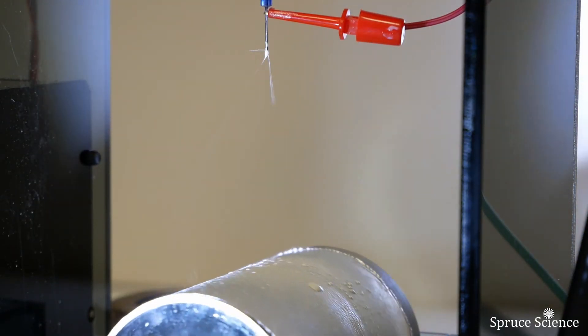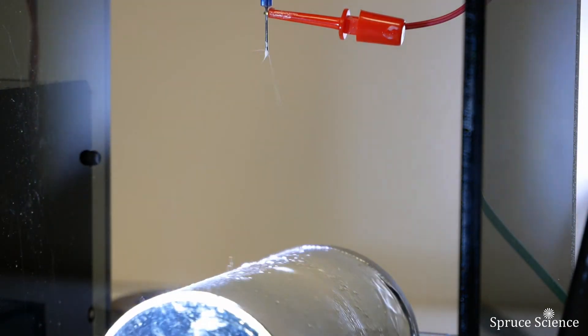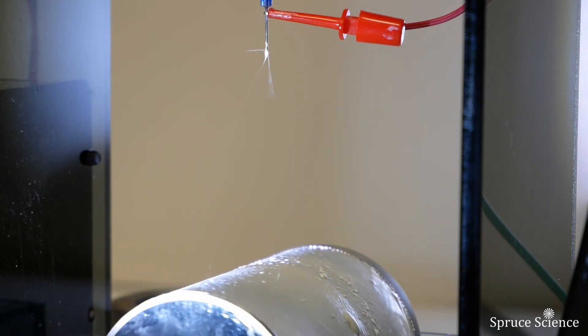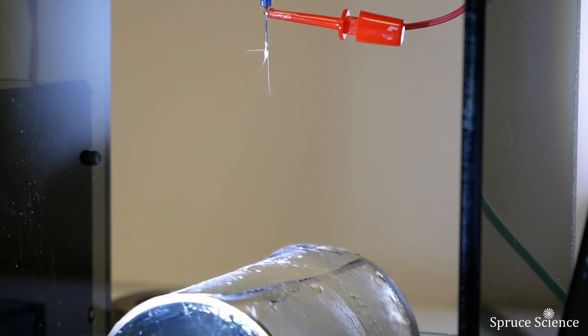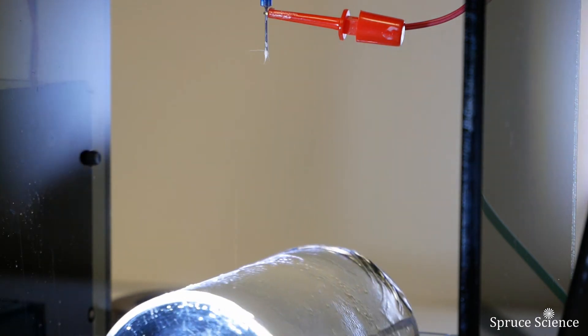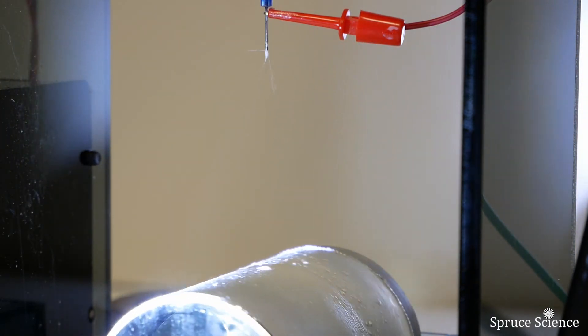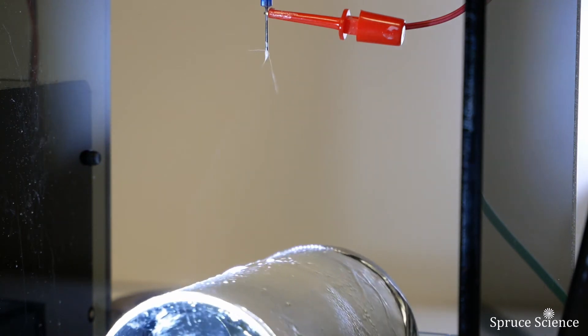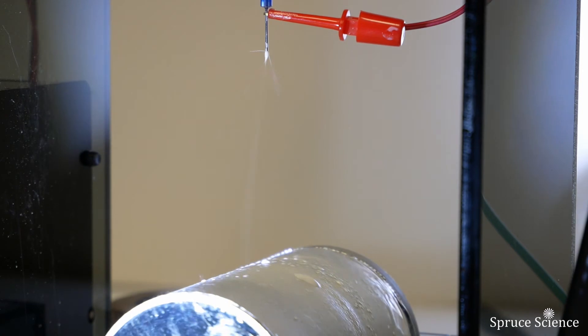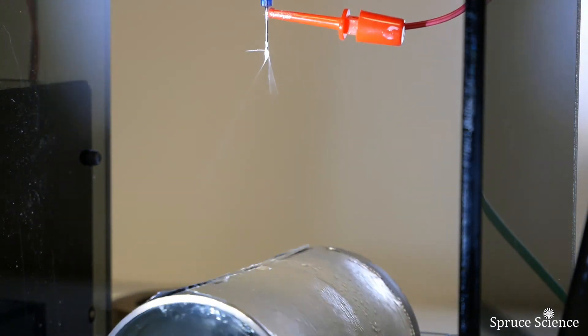The general observation for the electrospinning process is that if the applied voltage is too high and the extraction field exceeds the pumping rate, there are multiple spraying jets. However, if the applied electric field is too low, it leads to instability. For performance tuning, having an adjustable high voltage power supply is essential.